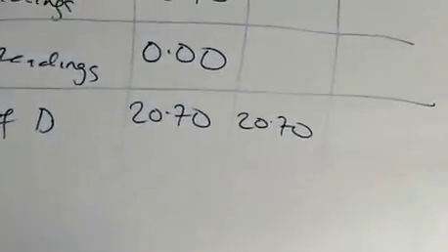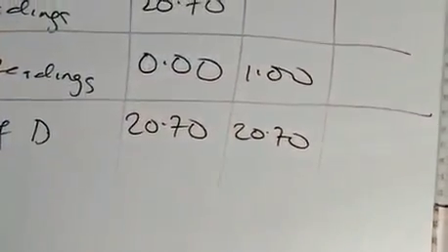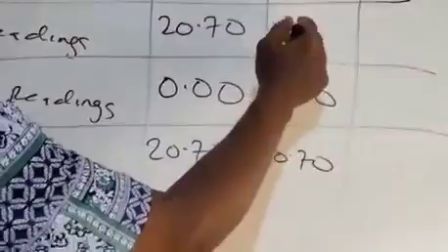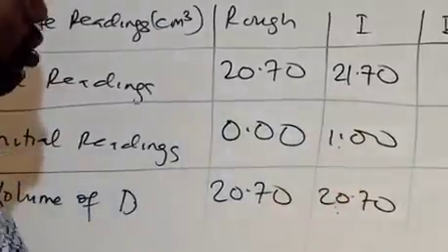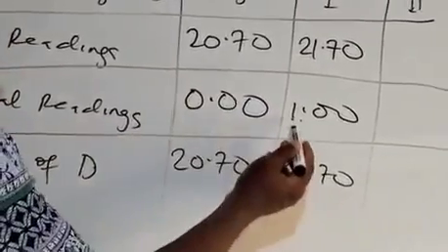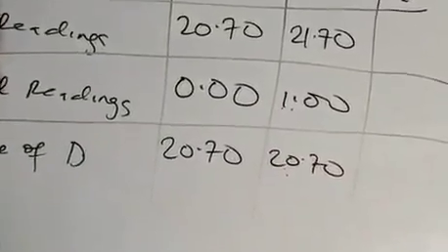And then let's assume you want to start from one whole number. No longer 0. You must not start from 0. You want to start from one whole number. You add 1 to 20 to give the final. I'm going to give you 21.70. If you add this, you have this. So what do you do? You're going to pour more acid into the burette to start from one, and adjust one whole number as the initial. Then you run the acid speedily.